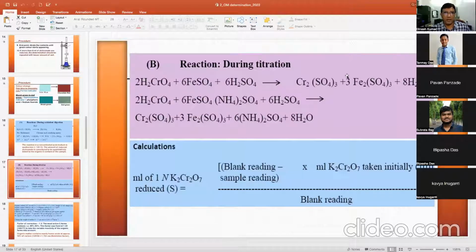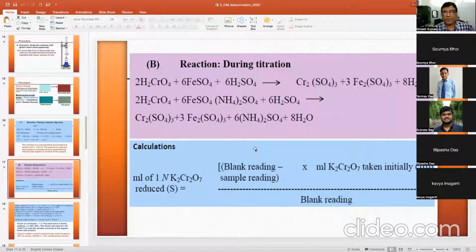So welcome back in the class. And now I think you are aware of these reactions. And in our days, when I was a student, we used to make chromic acid by having potassium dichromate and sulfuric acid. So we will make the chromic acid, and that was used to clean the utensils or glasswares. Glasswares which are difficult to clean by ordinary cleaner, then one can make chromic acid, and it can immediately clean.